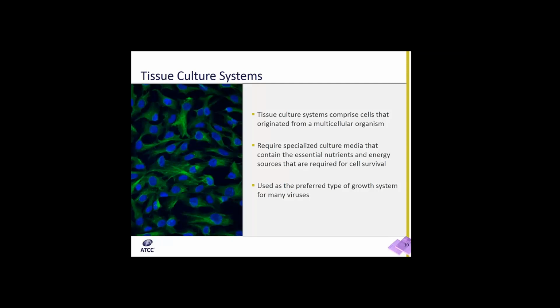One point to remember about tissue culture or cell culture systems is that to ensure the viability, the genetic stability, as well as the phenotypic stability, cell lines need to be maintained in the exponential phase. So do not overgrow your cell culture in your flasks to the point that it is overgrown and crowded, or the cells will undergo a phenotypic change.